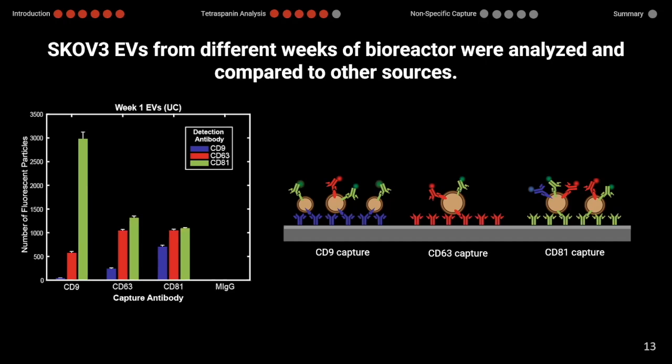And also regarding the ExoView, William Ross was asking, do you have test-retest reliability data for ExoView? Yes, when we do retests, it's very tight, with small error bars. I don't think this one shows it here, but we did this week 1 three times in a row, and it showed exactly the same thing. And interestingly, when we did those different 6 weeks, there were slight differences in the 6 weeks of those SKOV3 isolations, and those did stay the same. So there were slight differences in the subpopulations, and we could always recapitulate that. The same isolation of EVs always looked exactly the same.